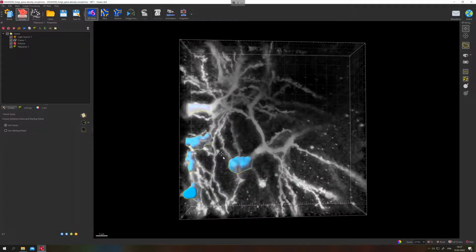Here I just want to go to the next step, which is the one that interests us the most, which is the soma creation. And I think this looks pretty good to me. So let's just finish right there, without any other considerations, since we just want to keep those somas here and use them as a starting point. So we'll have to wait a bit.